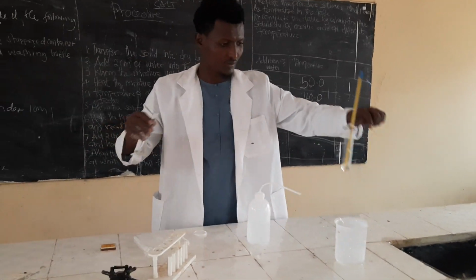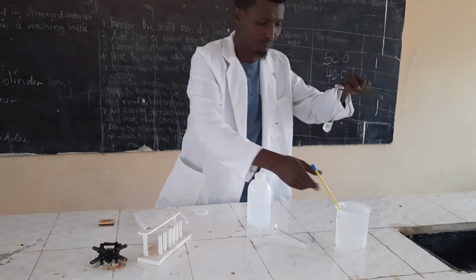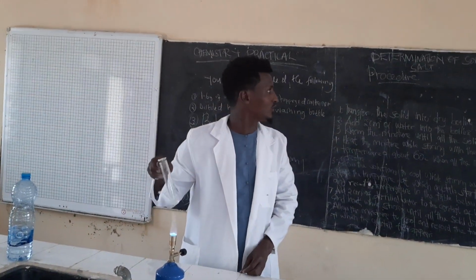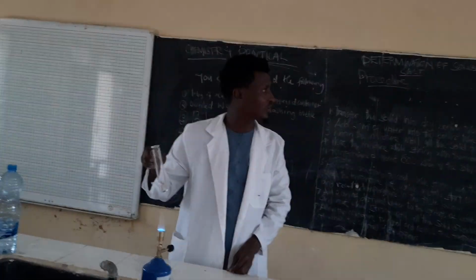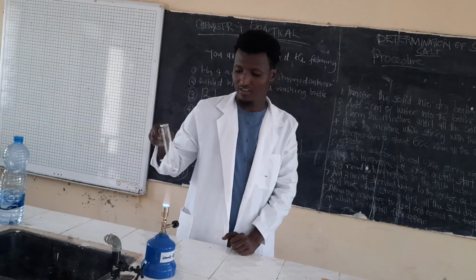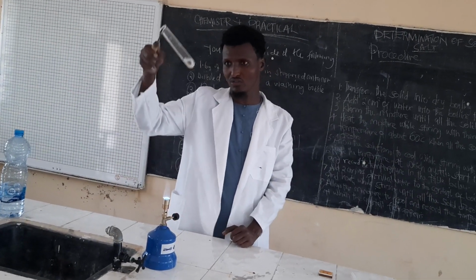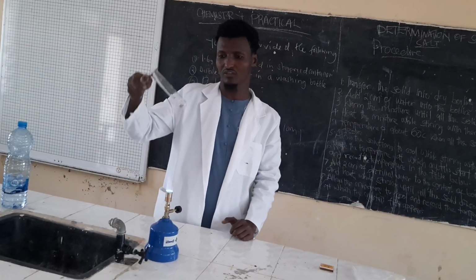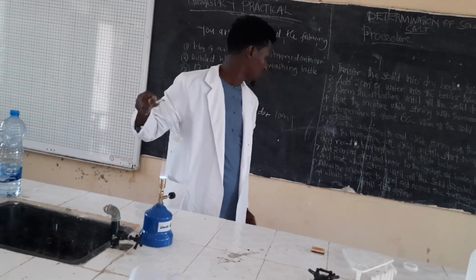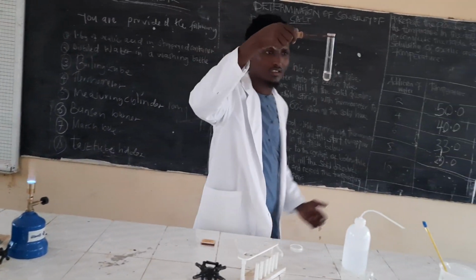Good. Then again, I'm working to that procedure: repeat all the procedure 3 times and record the temperature in the table below. So I'm repeating. This means I'm dissolving all the solid now. Heat the solid until it dissolves, then allow it to cool.